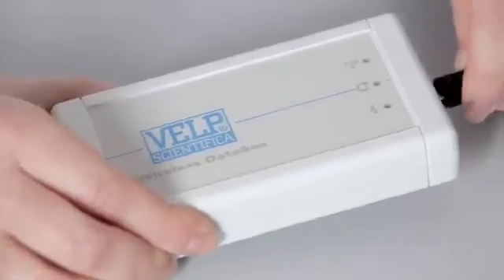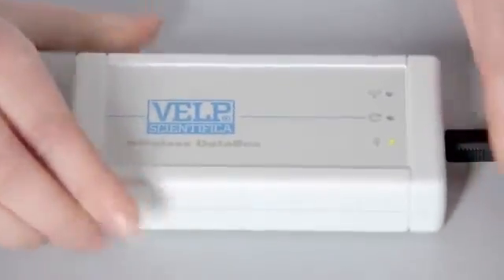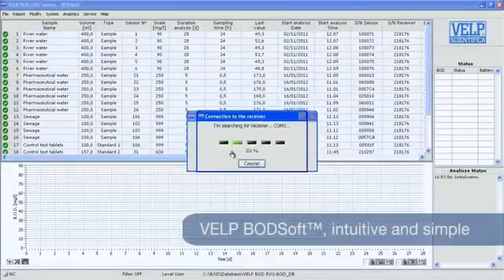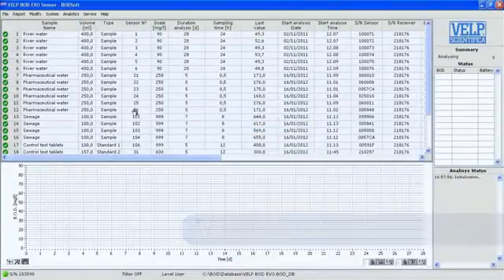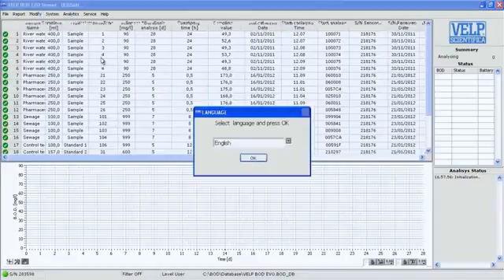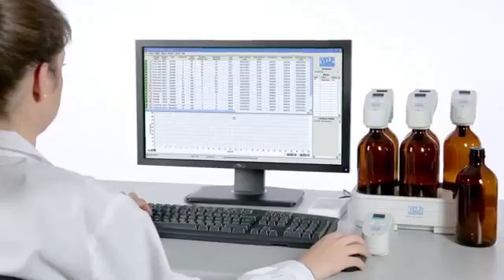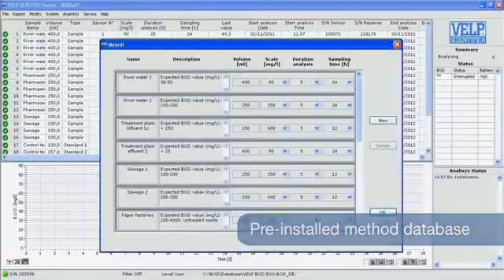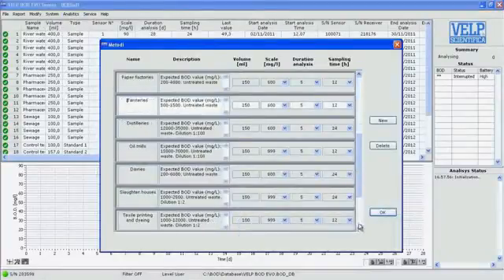BOD EVO is entirely controlled through the dedicated BODSoft software, intuitive and simple to use. It is available in different languages to facilitate communication. A pre-installed method database, according to the most common applications, simplifies user activities.